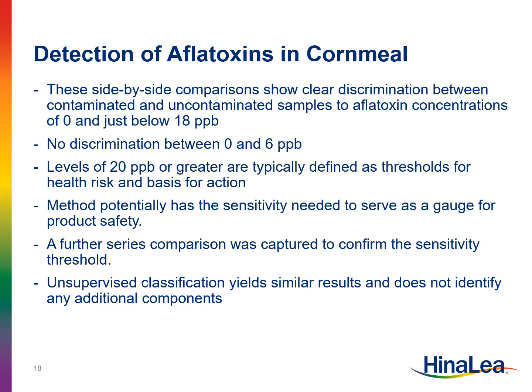This is of note as levels of 20 parts per billion or greater are typically defined as thresholds for health risk and a basis for action. This means this method potentially has the sensitivity needed to serve as a gauge for product safety. A further series comparison was captured to confirm the sensitivity threshold. Additionally, unsupervised classification yields similar results and does not identify any additional components.